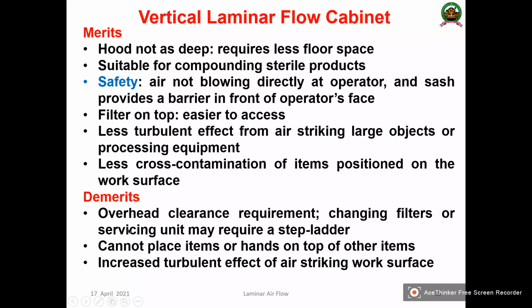Then what are the disadvantages? Overhead clearance requirement is the major thing, that is, changing the filter or servicing the unit may require a step ladder. We always need to clean the filter, and you need to service the filter. Periodically the filter needs to be changed, and we cannot place the items or the hands on top of other items. Increased turbulent flow of air striking the work surfaces, so that is another important issue.